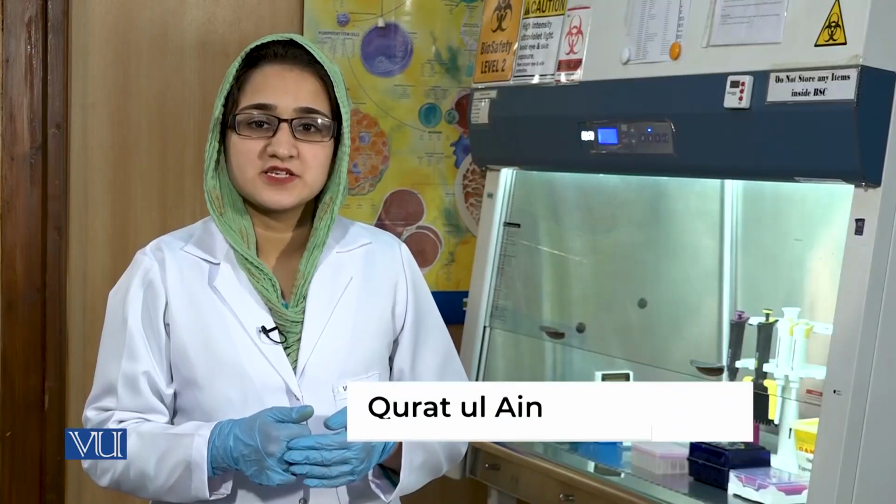So dear students, this was all about cDNA synthesis using the RNA template. Now we will quantify our cDNA using the nanodrop, and then we will store it at -80 degrees for further use.